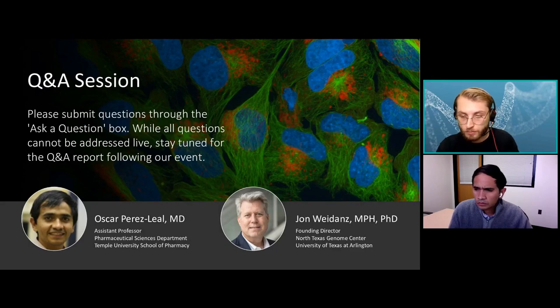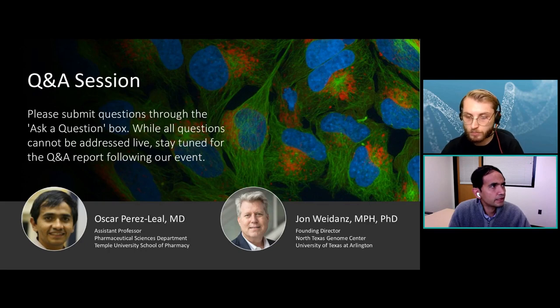So that's a really good question. We have developed some models where we are asked to target a very low expressing protein. And one way to solve that is, for example, if your protein happens to be stimulated by some kind of treatment, during the selection process, you can put that stimulant there. So imagine that there is a compound or some kind of manipulation in the cell culture that you can do to bump up the expression of that protein during the selection process. That can help you select the protein.